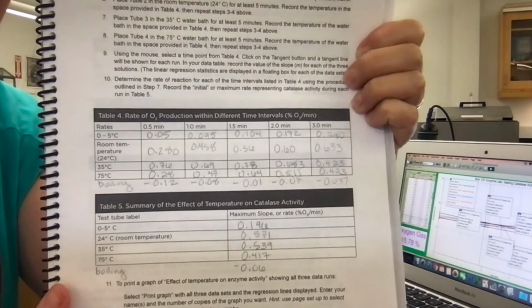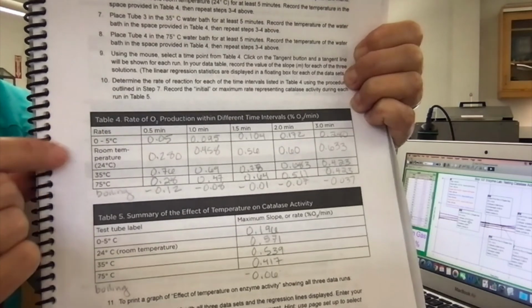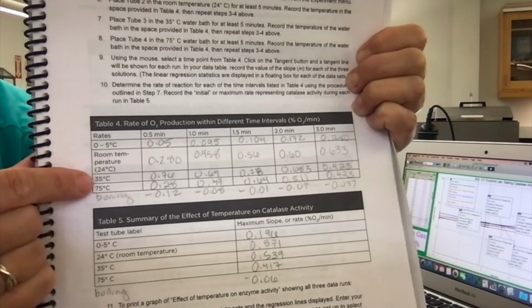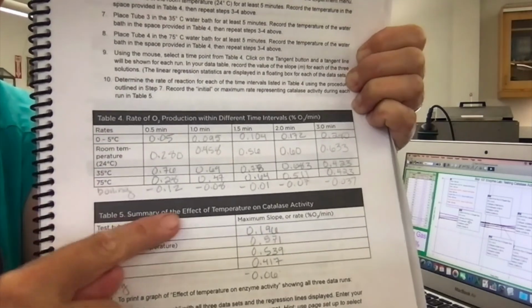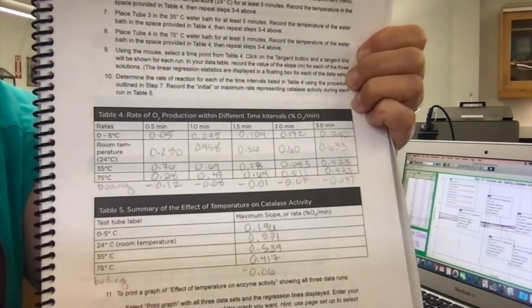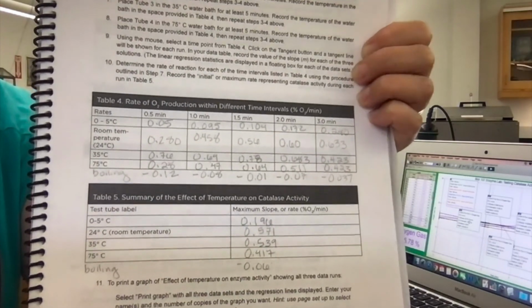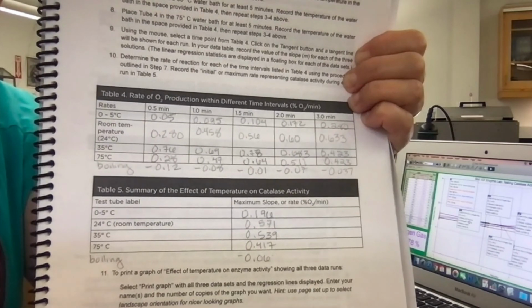I'm going to take a picture of it. This time I've got it for 0, room temperature, warm, the hot, and then the boiling hot one. And you'll notice that the slopes for boiling hot are all negative numbers. That's because essentially no change happened at all. And then these are the maximum slope numbers. I'll take a picture of these too.